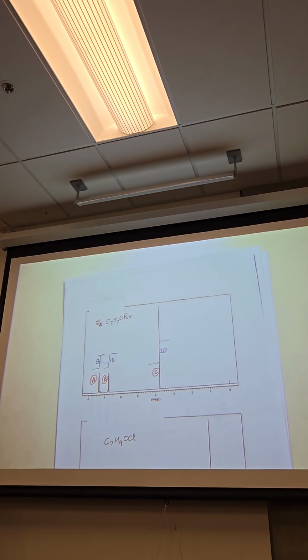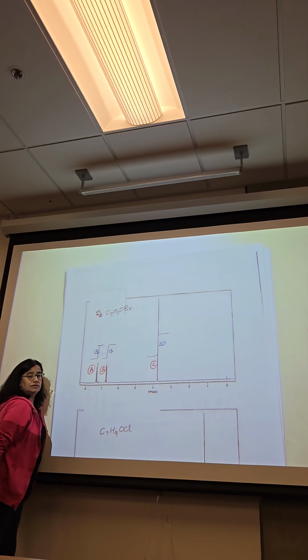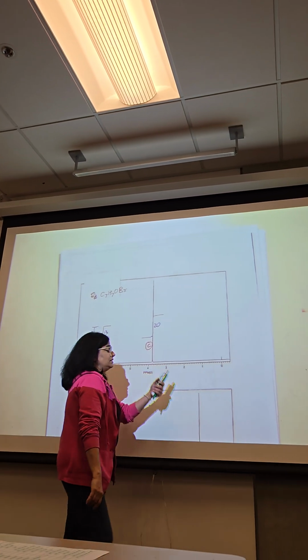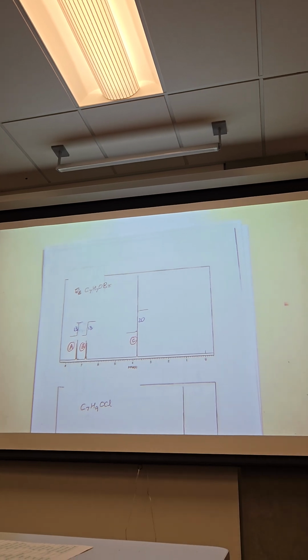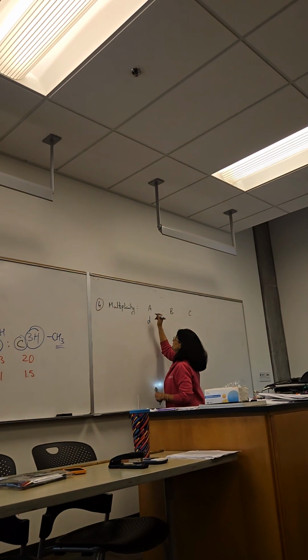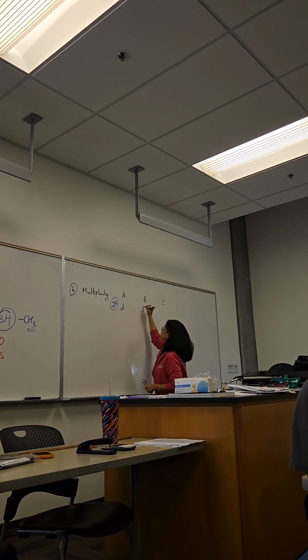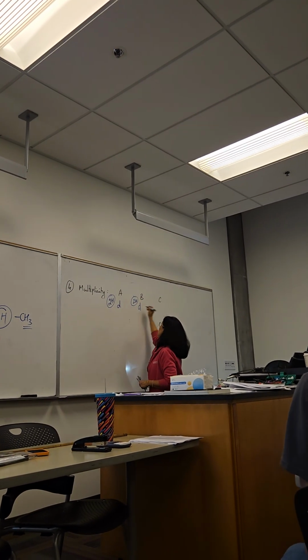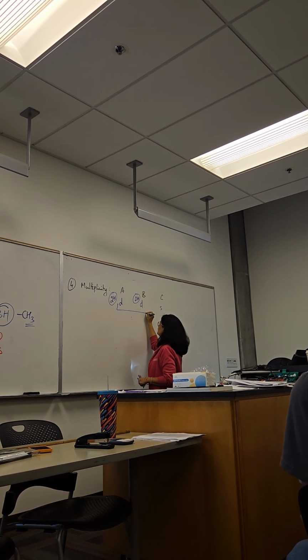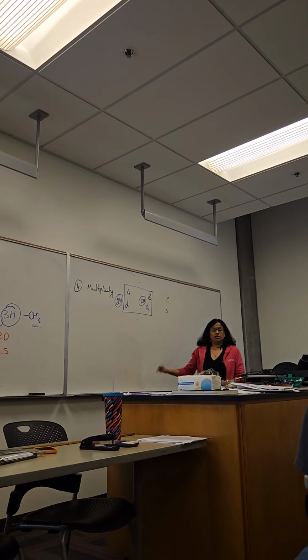We good? So if you look at signal A, do you see it's a doublet? What about signal B? Also a doublet. And what about signal C? It's a singlet. Doublet for 2 hydrogens, and I want to remind everybody, this is a doublet for 2 hydrogens, and this is a doublet for 2 hydrogens as well. And of course, this is a singlet for 3 hydrogens. But let's focus on this because it never gets clearer than this.